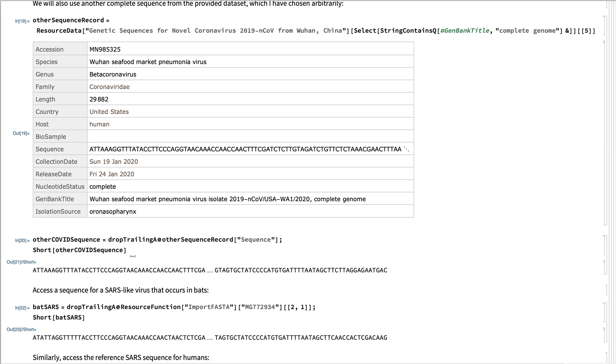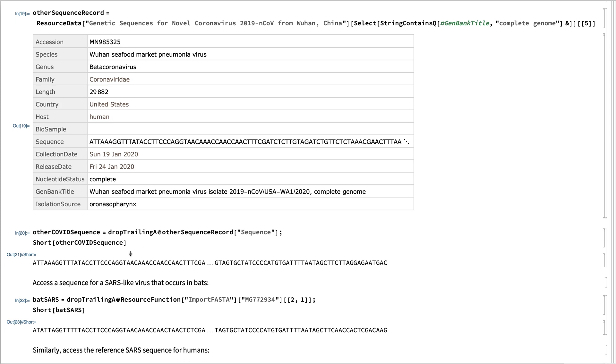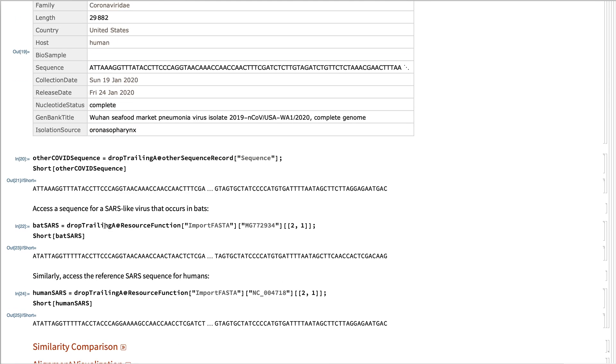And so now I also have the SARS-like virus that occurs in bats. So I've gathered that by using the resource function import FASTA.